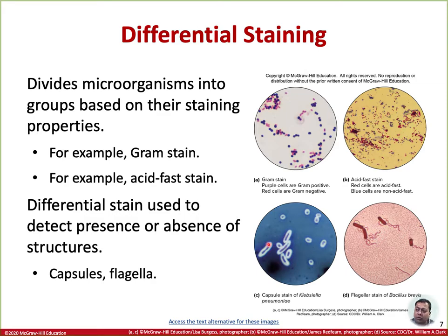So the rod-shaped structure that you are seeing inside the capsule is the bacteria stained by the basic dye, positively charged, and it is attaching to all the negative structures that bacteria and most cells contain. Remember that we already talked about how most of the proteins and the nucleic acids are negatively charged. So most of these cells are negatively charged, which is stained by the basic dye having a positive charge.